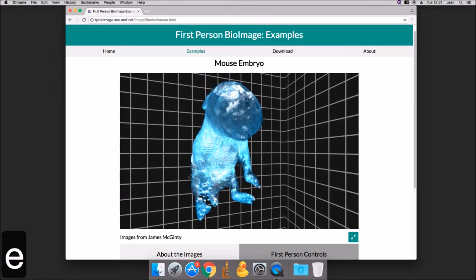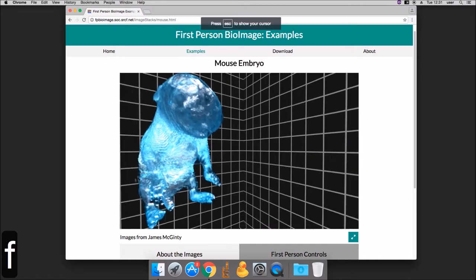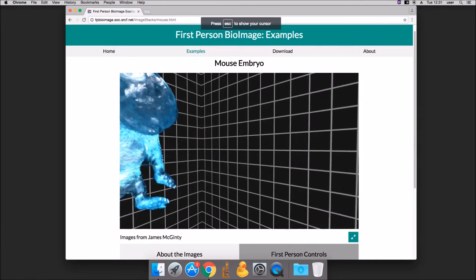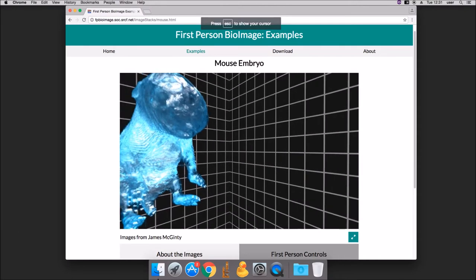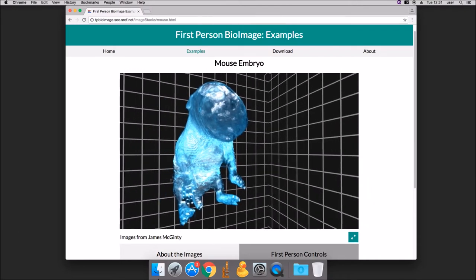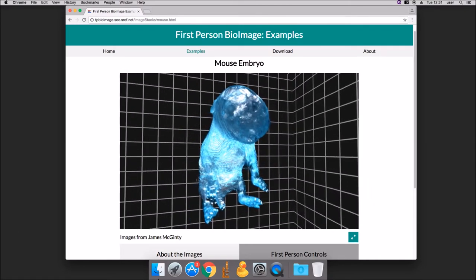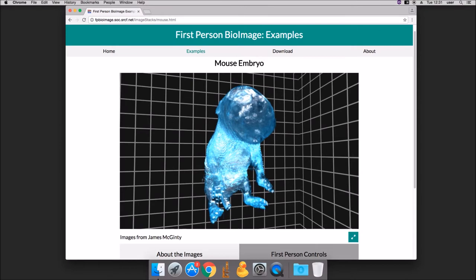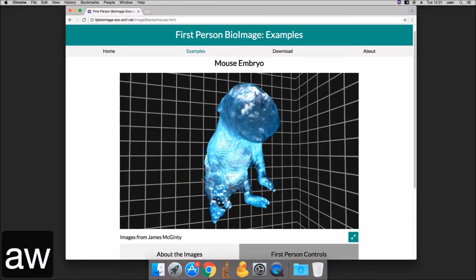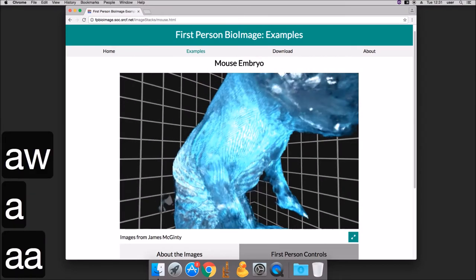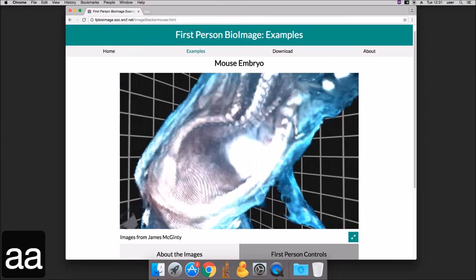You can switch to first person mode by pressing F. When enabled, the mouse is used to control the direction the camera is looking in. This can provide immersive views of the 3D data.